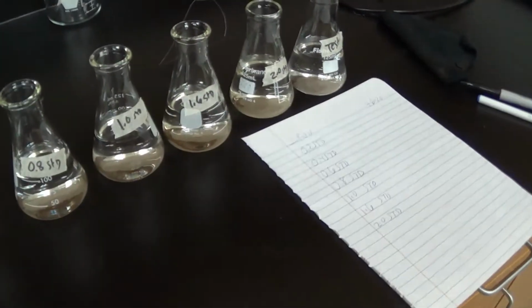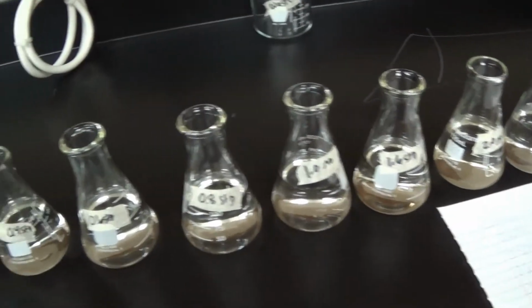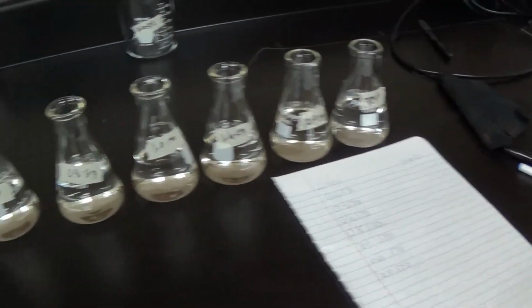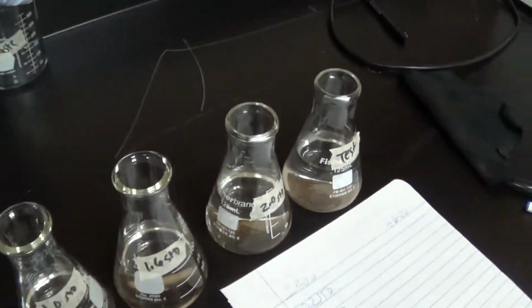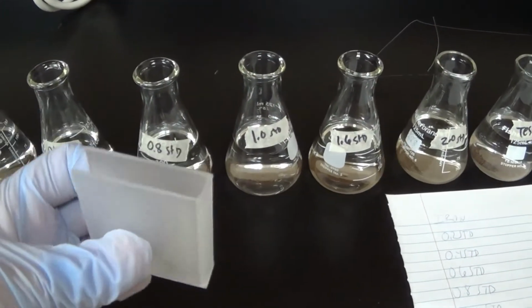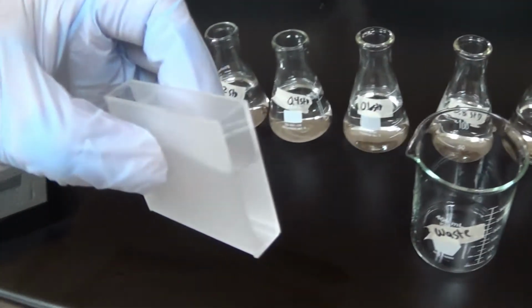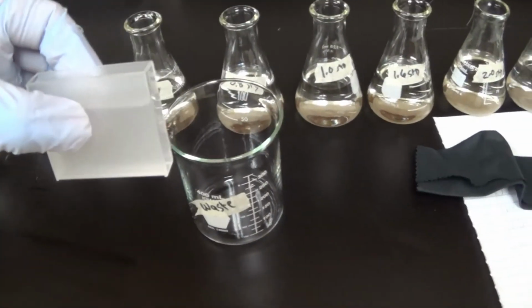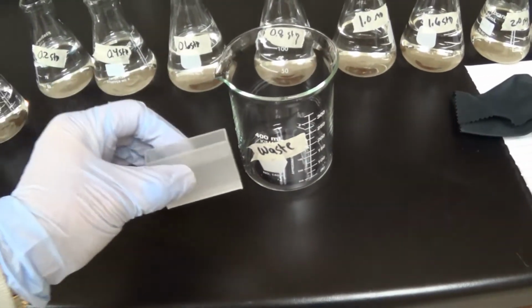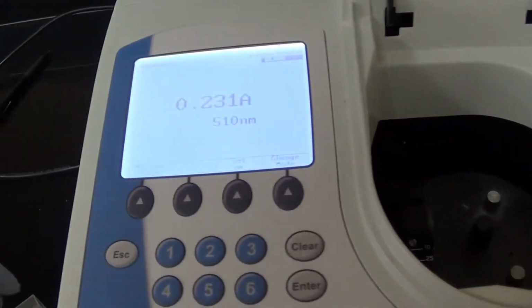So after color development, I poured the sample into these flasks so it's easier to pour. We did not get very good color with our procedure, so there will be modifications. But as a demonstration, here is our rectangle cuvette, and we need to blank our spectrophotometer. So I have poured the blank into the cuvette. We are using the same cuvette for each of our standards, so here's a waste bottle to dump in between, and we can do a little rinse with the DI water. So let's come over here. Let's put our sample in.